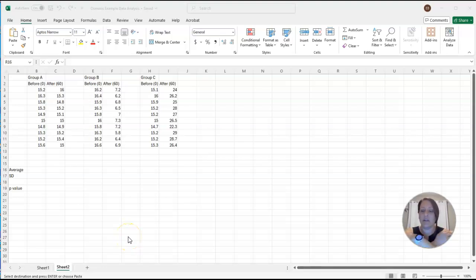Okay, so in this video, I'm going to talk about the osmosis lab experiment that we'll be conducting. Before coming to lab and performing the experiment, you should read through the lab packet and also complete the pre-lab questions.